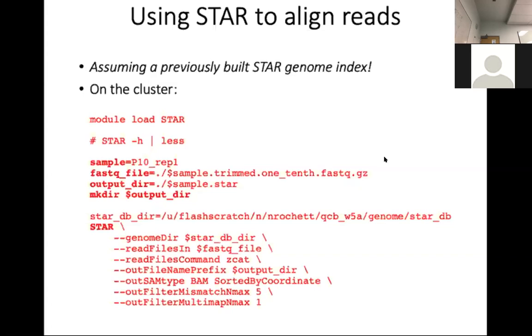Right. So the programs directory is into the QC directory, and then I was in the programs directory. Then I typed cd dot dot, and then I was in the directory of other images. Oh, sorry. If you could comment again, because the only Yes. I just did alt tab without really paying attention.